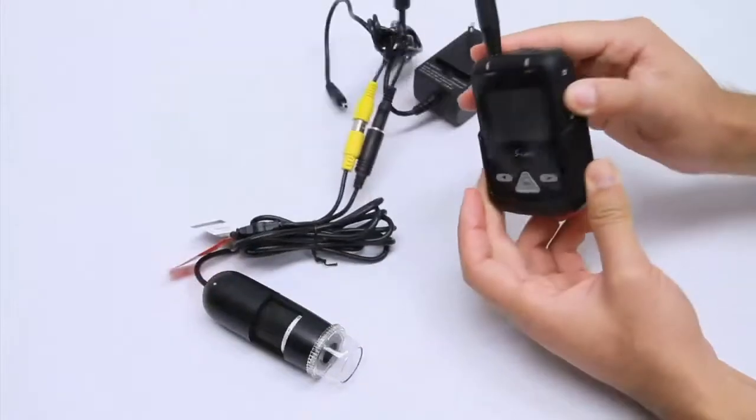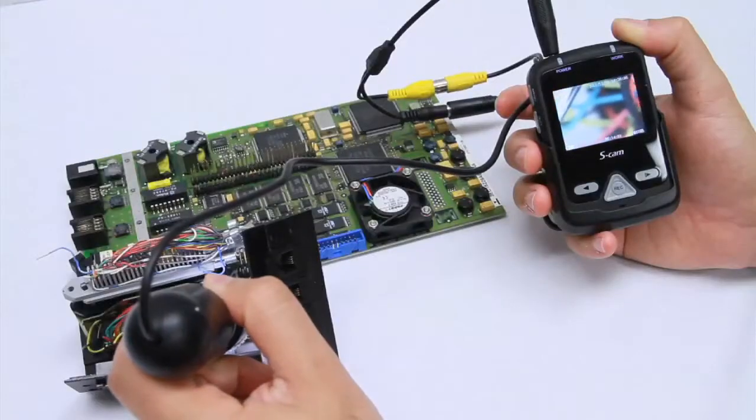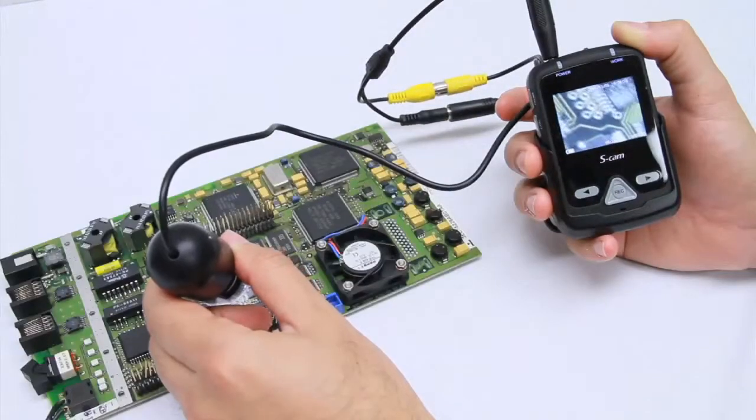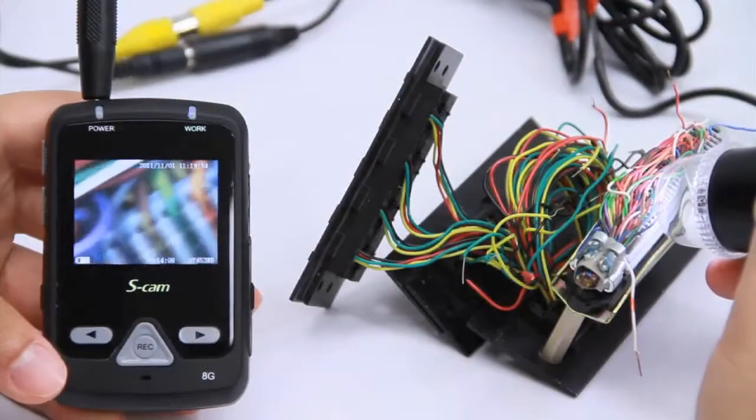To turn the unit on, press and hold the power button for 3 seconds or longer. The MS-D09 has a 2 inch LCD display and an easily accessible AV output.